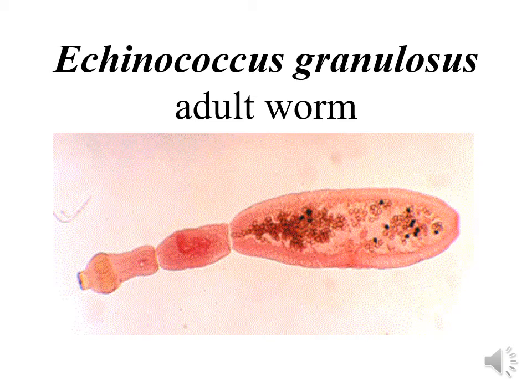This is an adult Echinococcus granulosus. It is common among people who are breeding, for example, cattle or sheep, and they're having dogs to help them in controlling those animals. So people who are living in close contact with their dogs are at higher risk with this infection. The parasite is simple in structure.